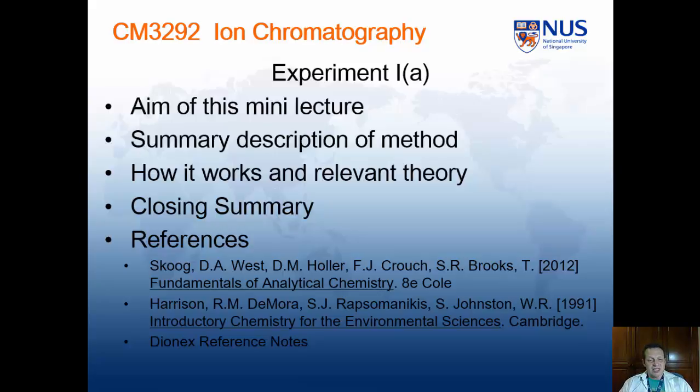But if you want real detail, the Dionex company, who manufacture ion chromatographs, and no, I won't make a statement about how good or bad they are, but they do have an excellent range of reference notes, over 100, and you can get these just by typing Dionex reference notes into Google. Very much recommended, rigorous method development notes, and we'll leave that there. So, onward and upward.